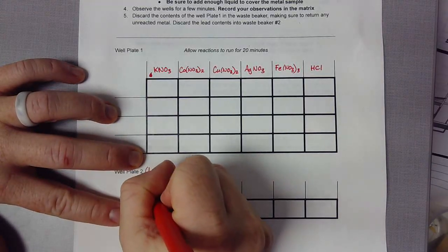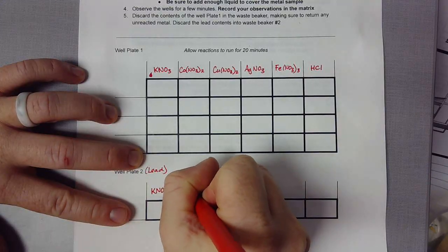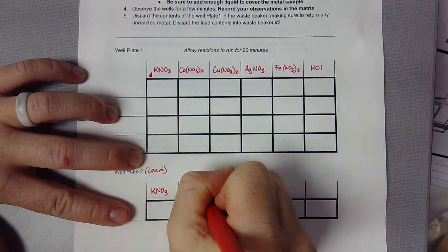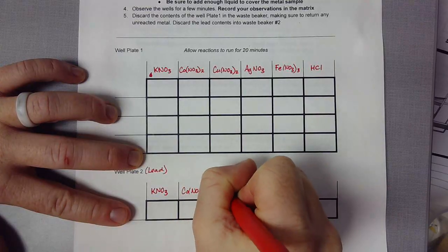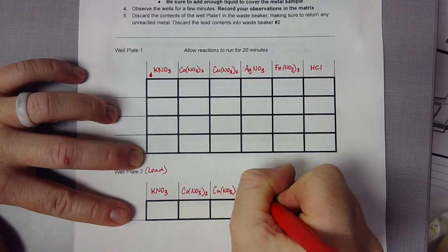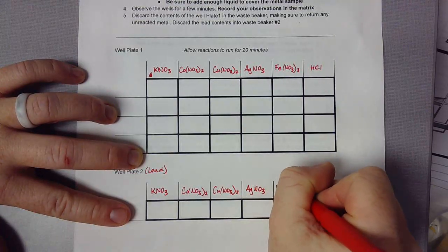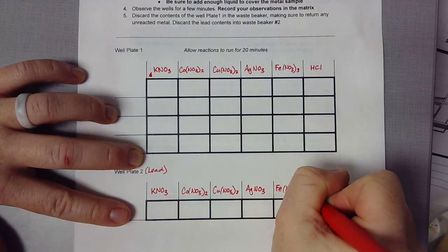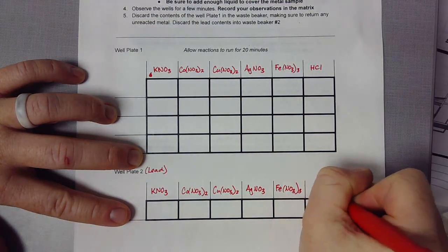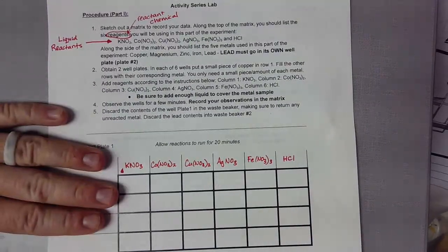However, the liquid reagents are going to be consistent between the trays. So I'm just going to copy them in. All right, so that's step 1.